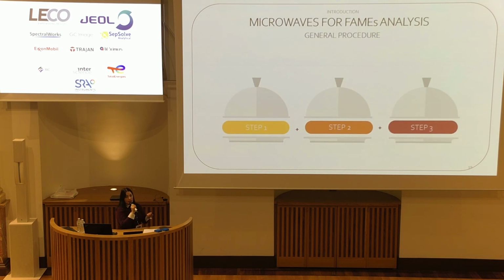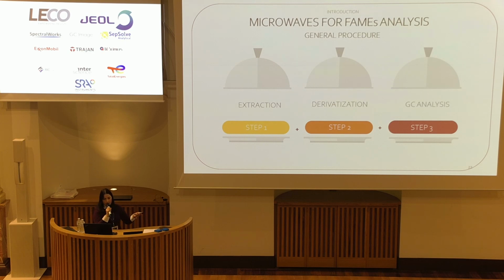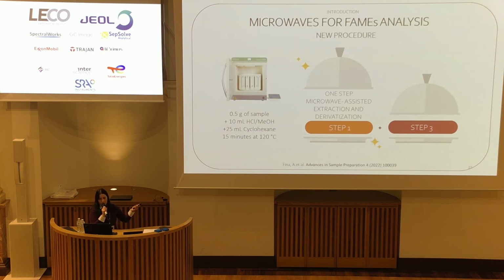For fatty acid analysis, the sample preparation is really important. It's also challenging, as it involves different steps. First, the extraction of the lipid fraction, then derivatization to have the corresponding methyl ester derivatives, and then the GC analysis. In our lab, a method was developed that merges these first two steps into a one-step microwave-assisted extraction and derivatization with all the characteristics shown. And basically, after 15 minutes, the organic phase that contains FAMES is ready for injection in the GC.